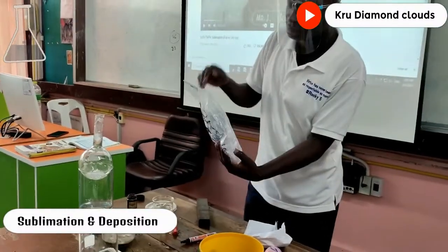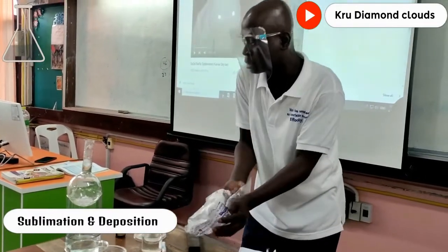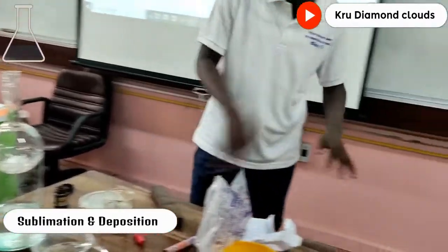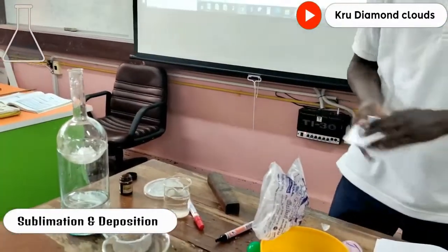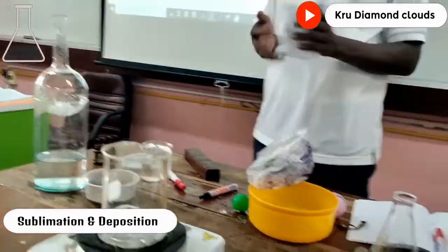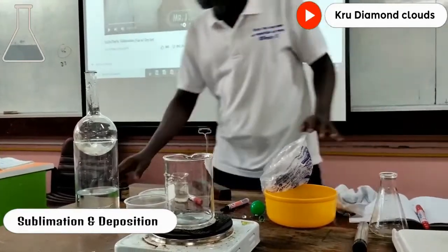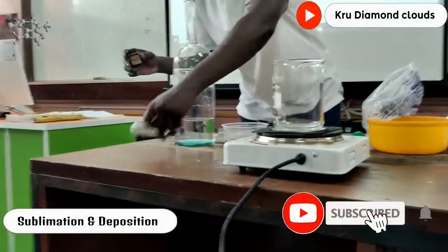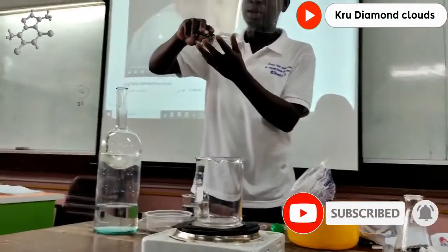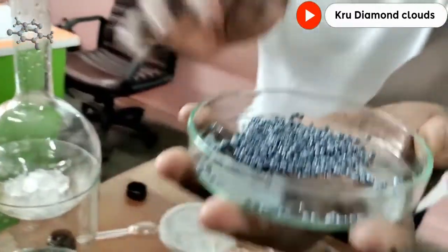Before we do that, we need to change the iodine crystals into gas first. I'm going to put some iodine — you know iodine, right? But this one is not the liquid one. This is the crystal. You can see, this is iodine crystal.